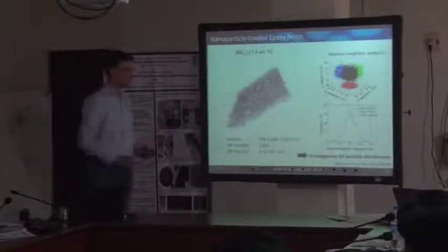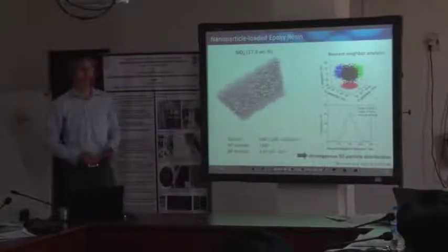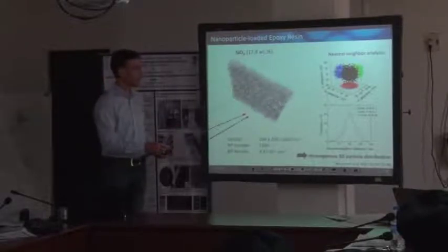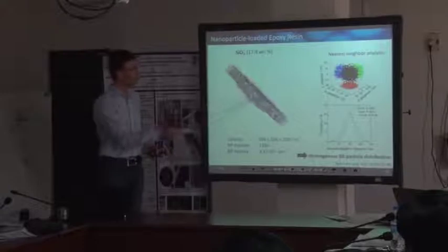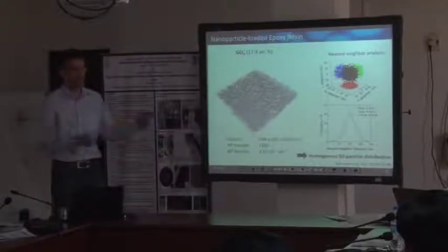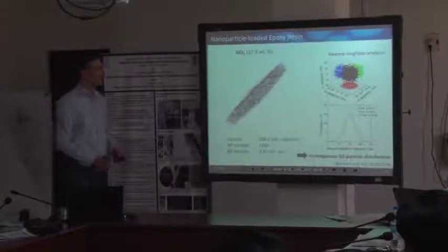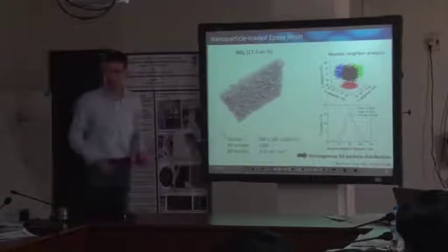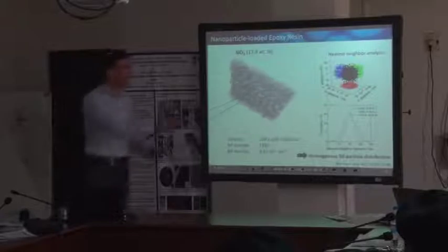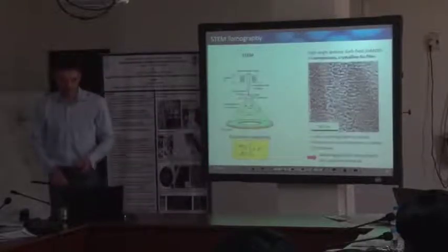And for Siemens company, it was of interest how those particles are distributed depending on the density of the particles, whether they agglomerate or not. And so we did some analysis on that just by measuring, let's say, the distances between those particles to come up with a three-dimensional distribution in real space, because this is, as I mentioned, insulating coating for transformers, and the question was how to enhance the lifetime of the polymer. So this was just in this particular case.